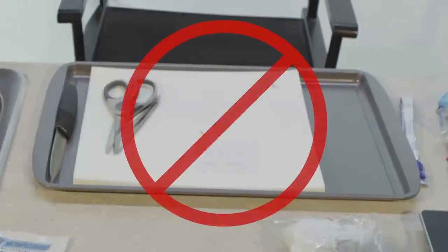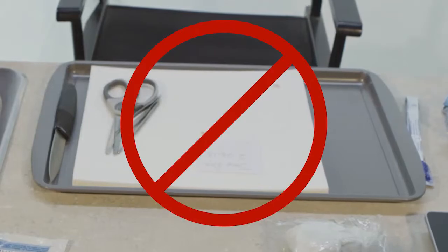Don't ever leave personal items unprotected on the work area. Wrap them in plastic or keep them separate.